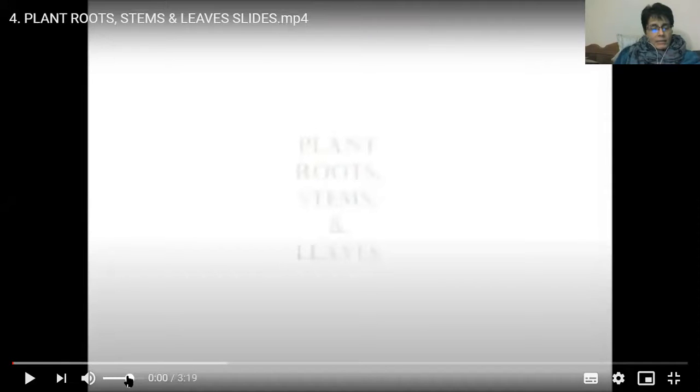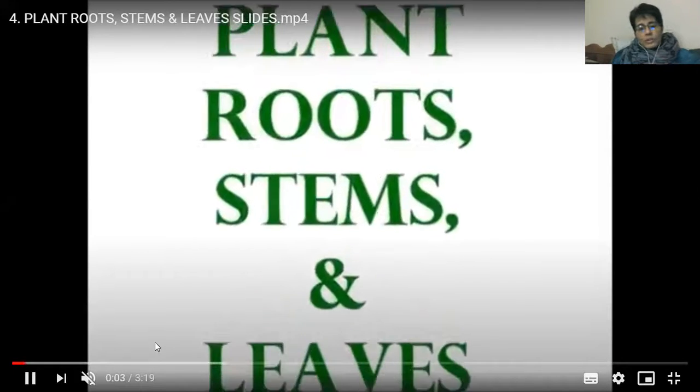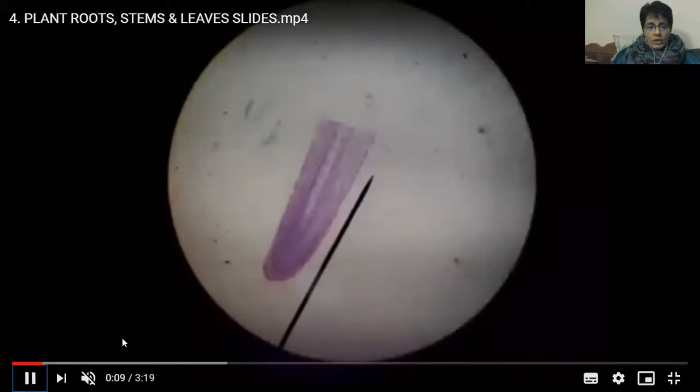But I'm going to put the sound down because there's a lot of chit-chat in the background. The class is talking in the background, and the teacher is trying to look down a microscope slide to show what I've just been talking about. So now, we were looking at cross sections, but remember a root, like a tip of an onion root, I've mentioned that before, that is the tip of an onion root under very low magnification. It's been stained, but you can't really see everything. This is the pointer, so that I can point to certain parts of the root while looking down the microscope so that you know what I'm pointing to.